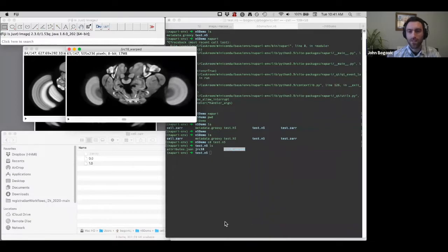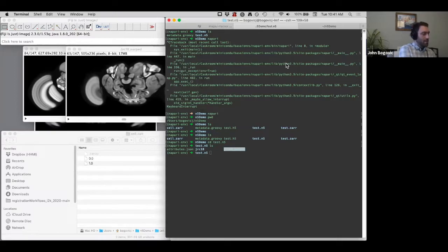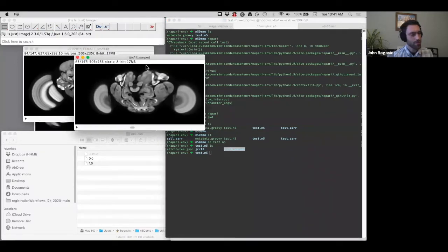So it's 10:40. We can talk about other things. I can mention some things that I didn't do yet. I can talk about some of the code. Specifically, I use ImageLib2 a lot, so I could talk about how I interact with these formats using ImageLib2. I could talk about more metadata, for example how you could write your own custom metadata to these formats. I could talk a little bit more about the metadata dialects that exist.